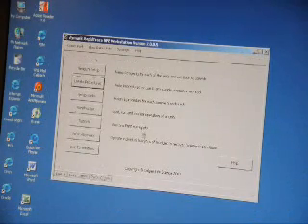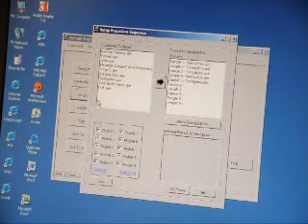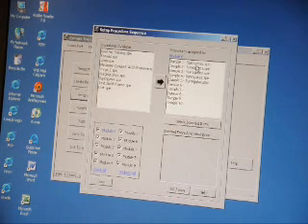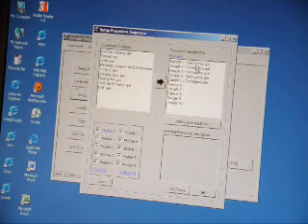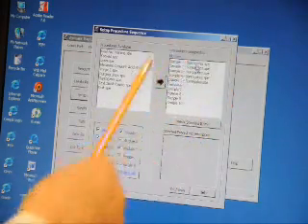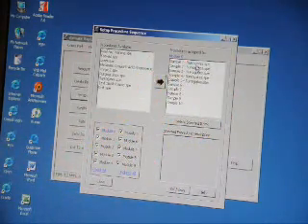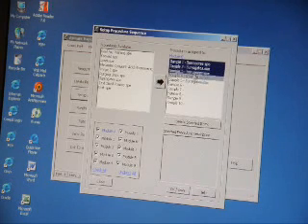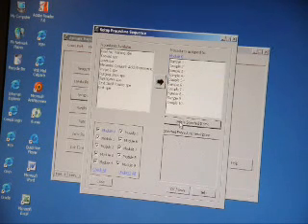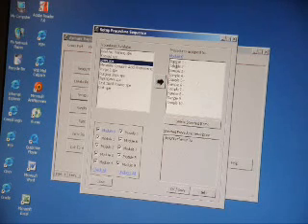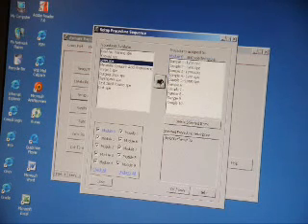And now what we're going to do is go to Setup Racks. In setting up racks, what we have here is on my current system, I only have one Rapid Trace module. And this is representative of that module. I'm going to start by deleting all the samples that are associated with it. And if I want to run the Lynn method, I could tell it I want to run Lynn for the first five samples.